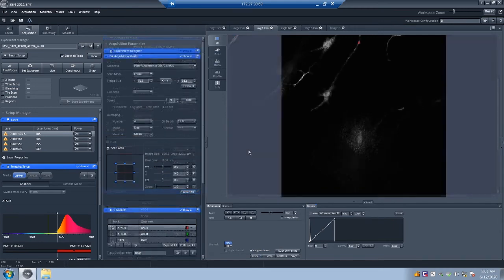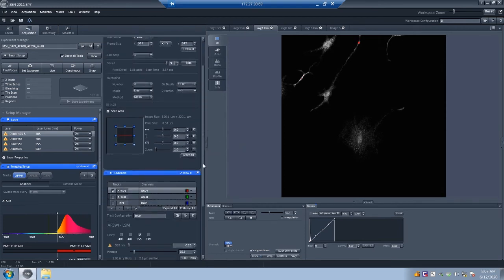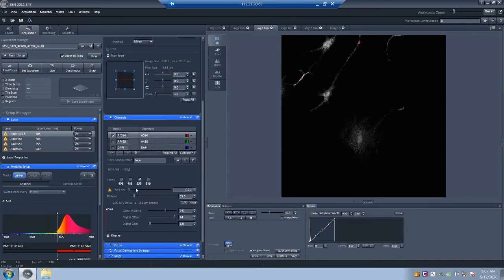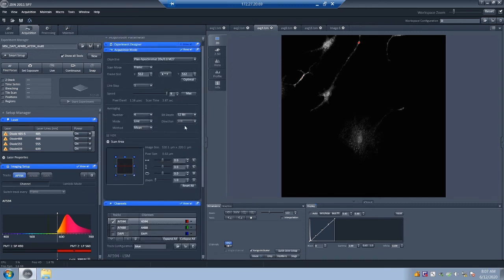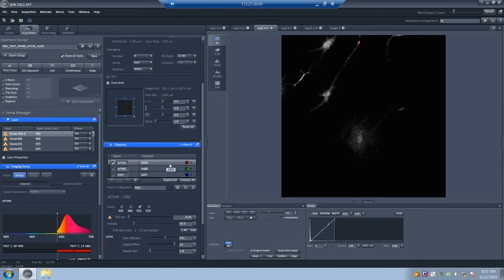To summarize: I've shown different ways of improving image contrast — first, balancing laser power and gain; second, using averaging; third, adjusting speed (not recommended). Final decisions are based on the signal-to-noise you need for your analysis. Note that speed and averaging apply across all channels, so decisions about them must account for all channels. So far we've only adjusted the red channel — let's adjust the others.